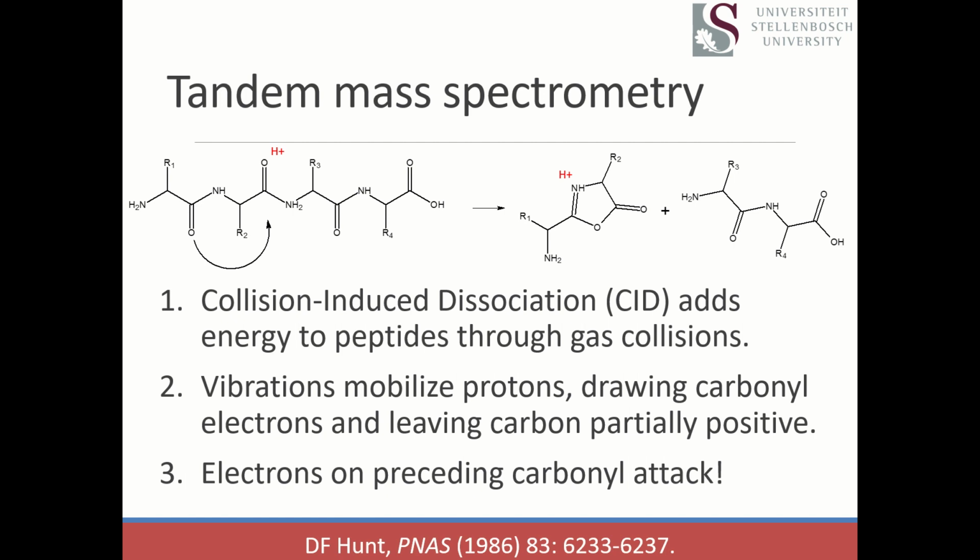In the case of peptide ions, it means that they've got more energy than they normally would. And that energy causes the peptide to begin vibrating in unusual ways. So remember that we're adding protons to these peptides before we put them into the mass spec. I mean, we've got them in acid, basically, and we've put them through a very strong positive charge in the electrospray source. And that means that we've got a proton sitting on board these peptides.